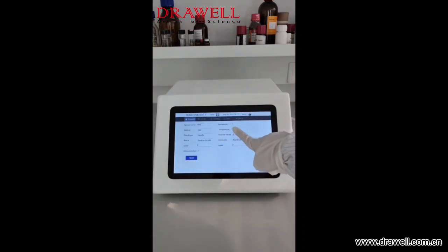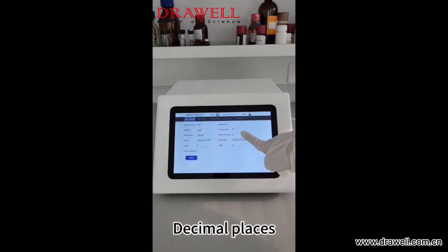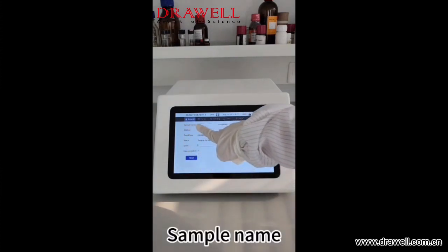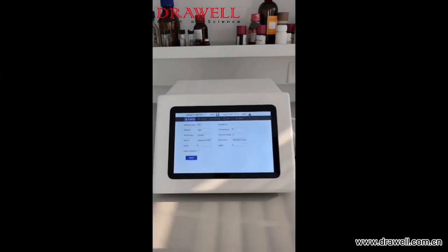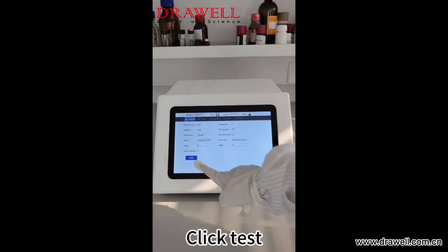Set the temperature and decimal places. Enter the sample name. Click test.